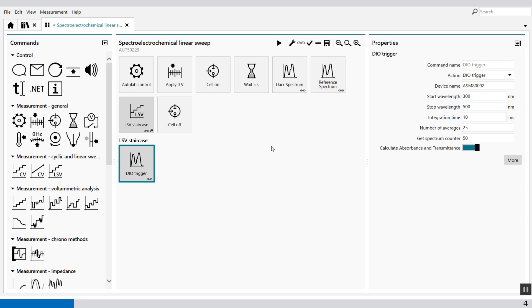Now the procedure is set. The cuvette is filled with an Iron 2 Plus solution, which is colorless. And the moment we scan it to positive voltage, it will change into a yellow color. And this color change we can visualize with the spectrophotometer. So it's a very simple reaction from Iron 2 Plus to Iron 3 Plus.